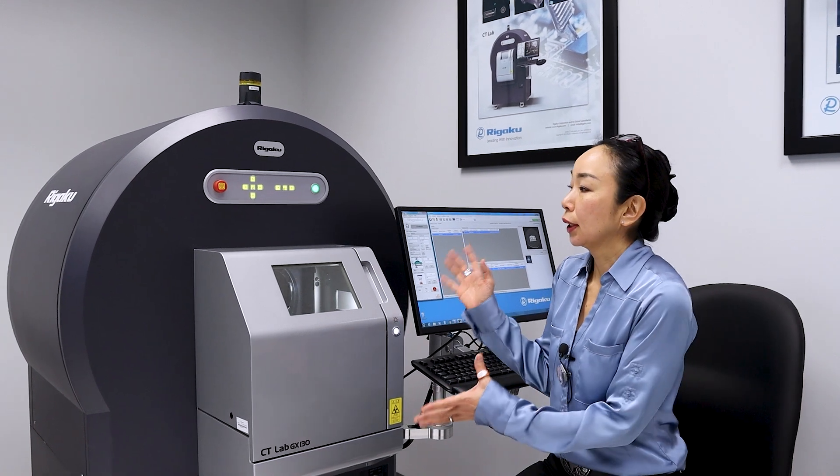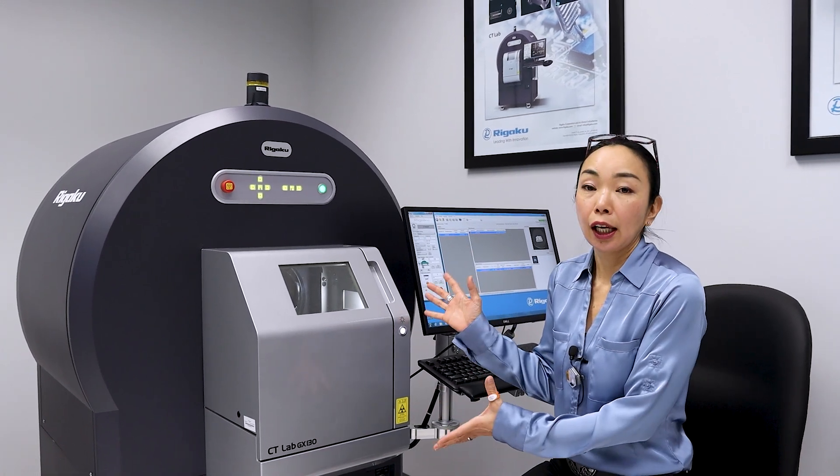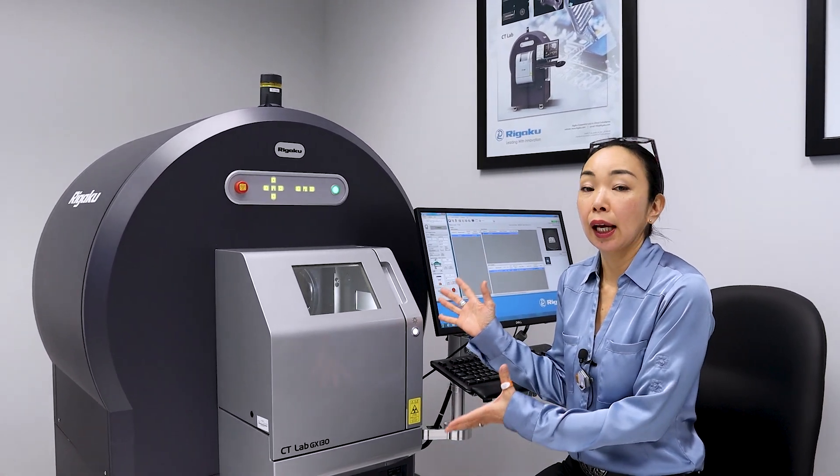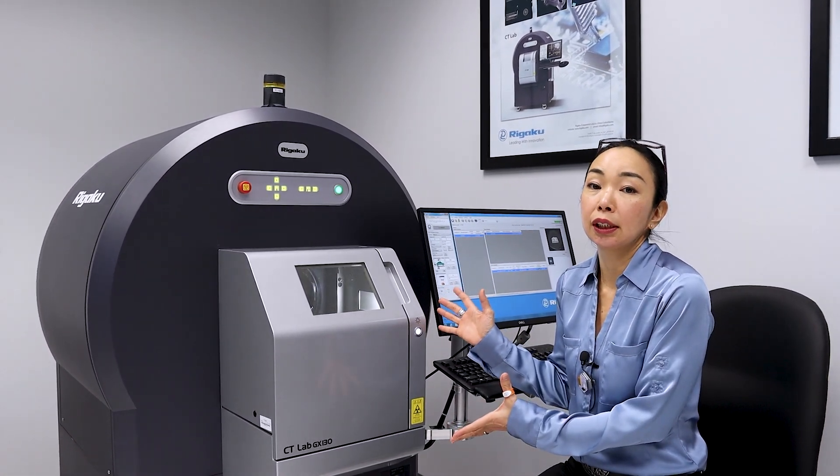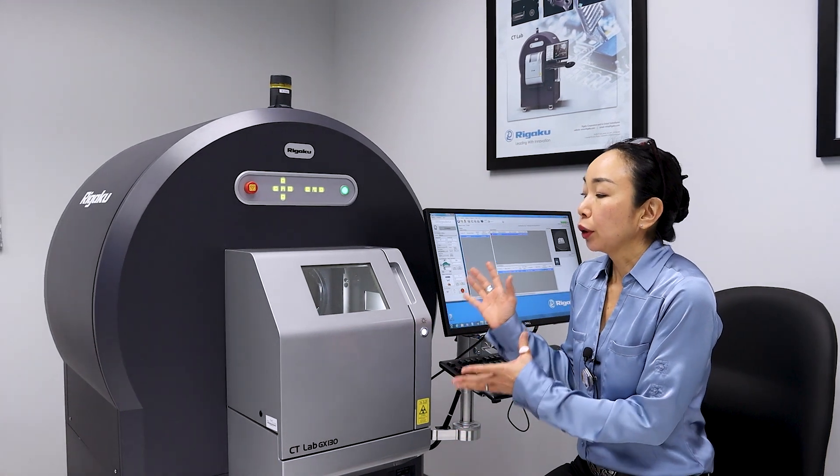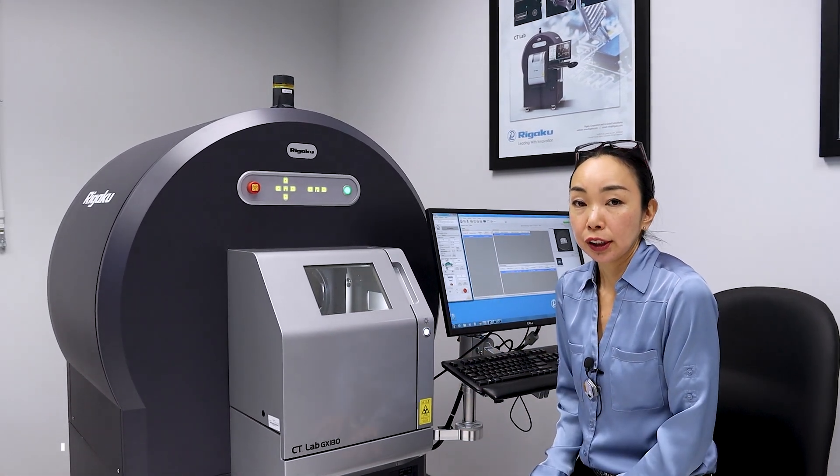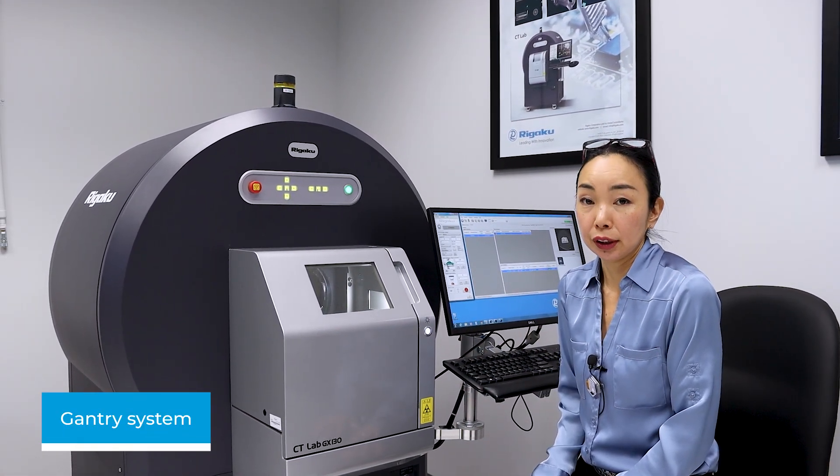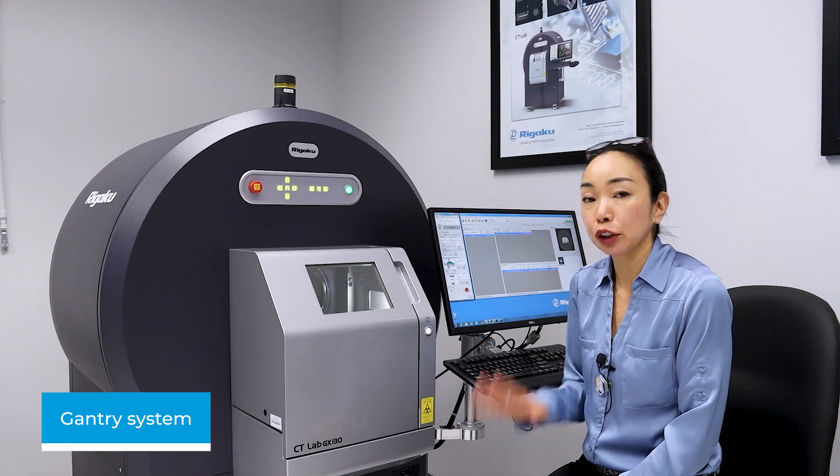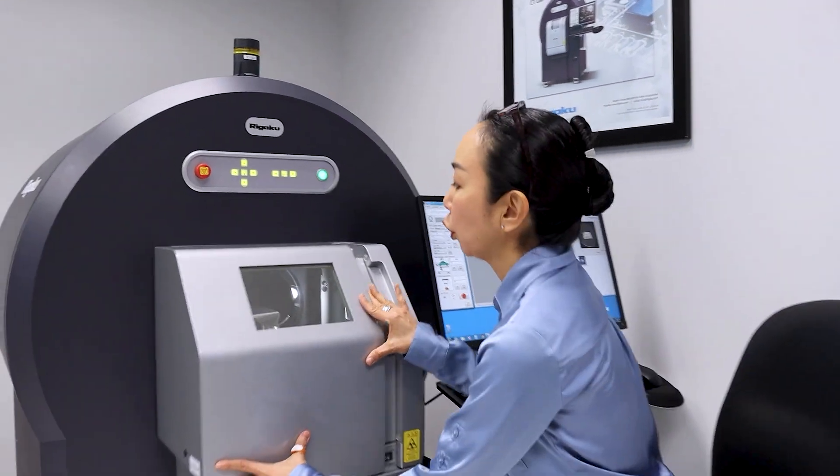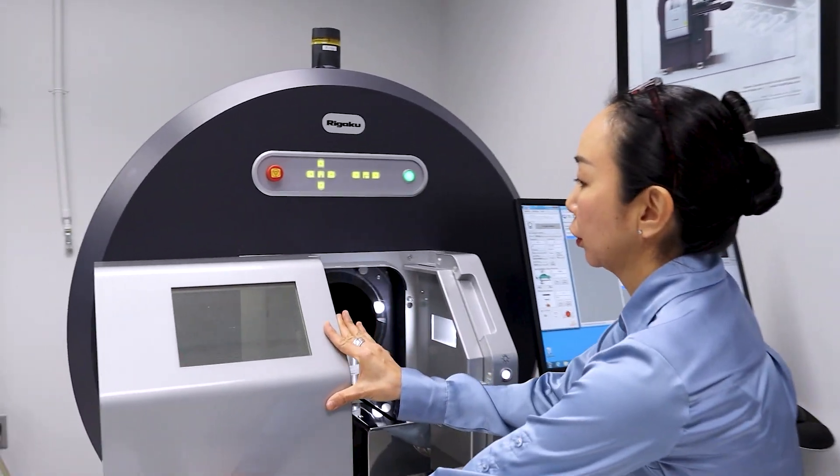So, this is the CTLAB GX, and this is a high-speed CT scanner. You can do high-speed scans on this system because this is a gantry system, and let me show you what I mean by that. So you open this door, you can just slide this out.